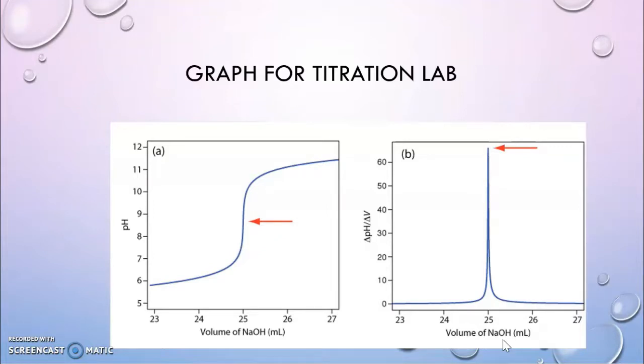In this second graph, you can actually determine the volume where the equivalence point occurs.